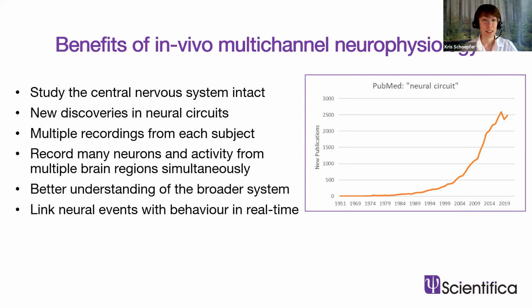And then lastly, with in vivo multi-channel electrophysiology in preps where animals are awake and behaving, you get the major benefit of linking neural time series events with behavioral actions in real time.